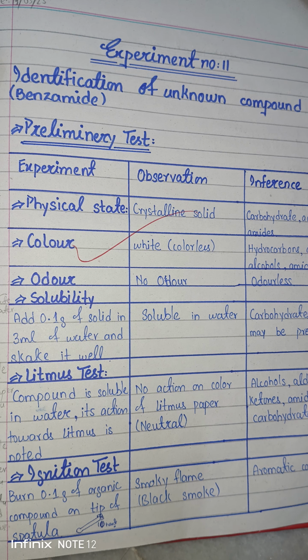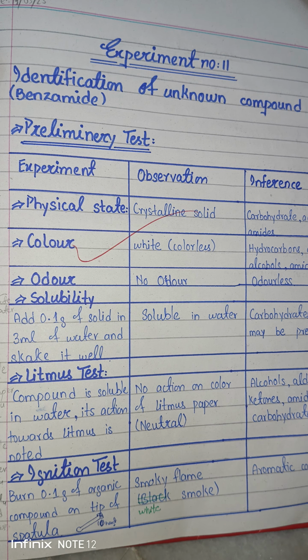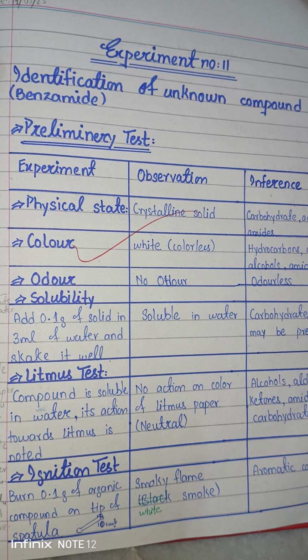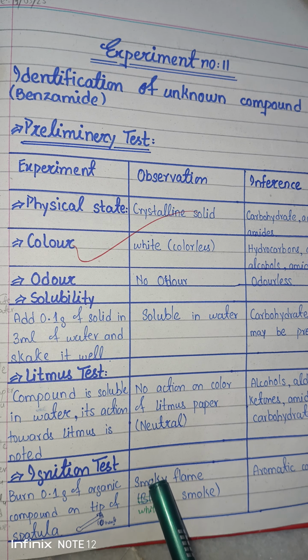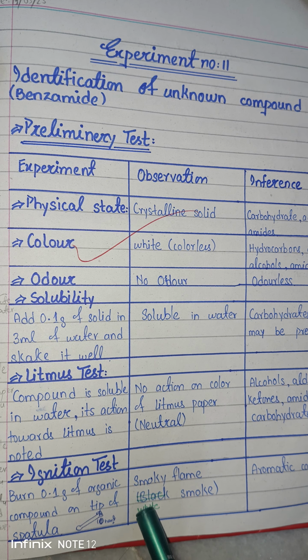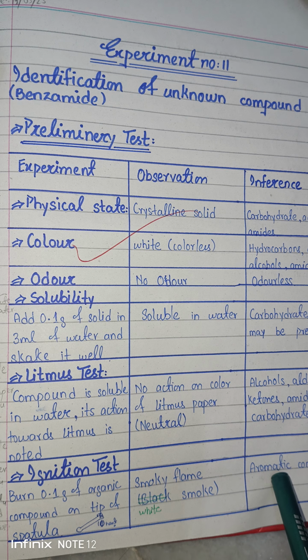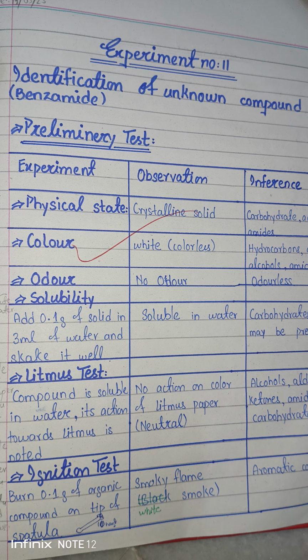Sorry, please correct this here: it is not black but white smoke that will appear. This is a mistake, please correct it. Whenever a smoky flame is shown, it means you have an unsaturated compound, and whenever the white color is shown, you will say some aromatic acids are present. So this is the identification.